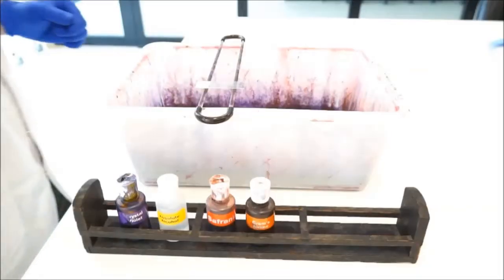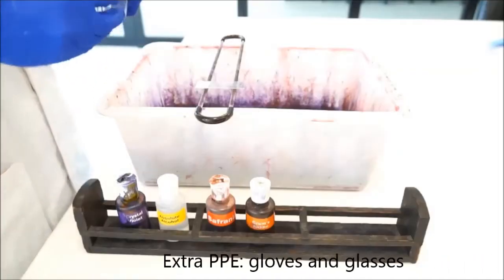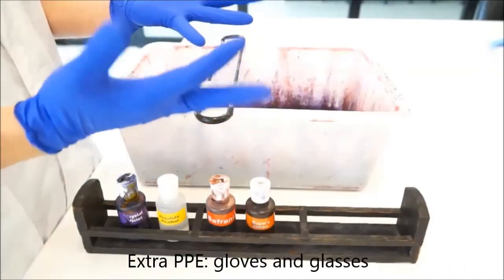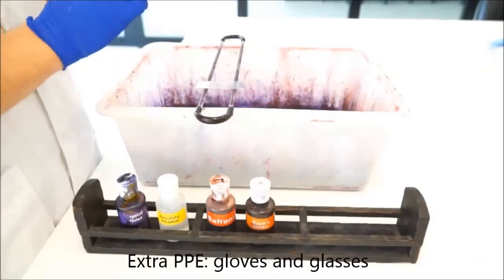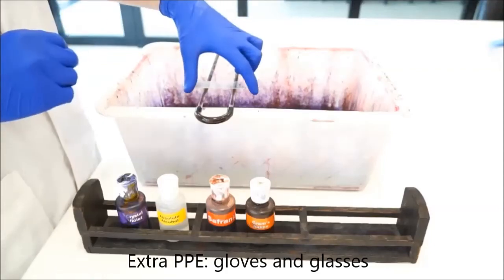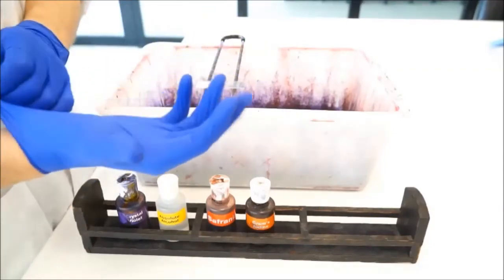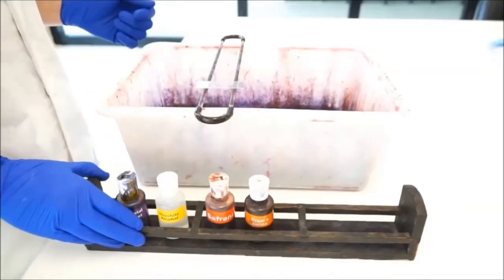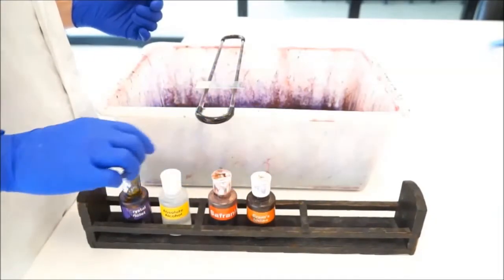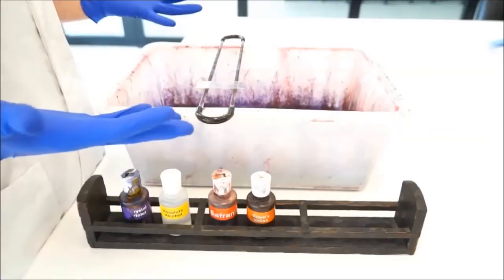At this point you want to be putting on safety glasses—you don't want these stains in your eyes—and also gloves. Previously when you were making the heat-fixed slide, you wouldn't want gloves because gloves and Bunsen burners don't mix. But right now, some of these stains are a little bit toxic, so I'd be wearing gloves.